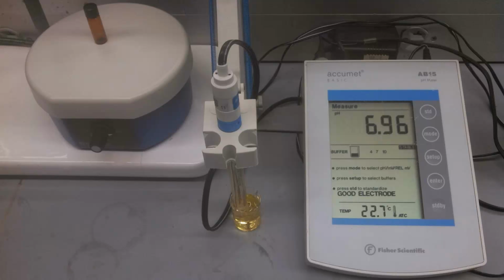If you don't see those words, it'll say either electrode error or just won't say anything. That indicates that your electrode needs to be standardized. So you can let me or the TAs know, and we'll give you instructions for how to do that.